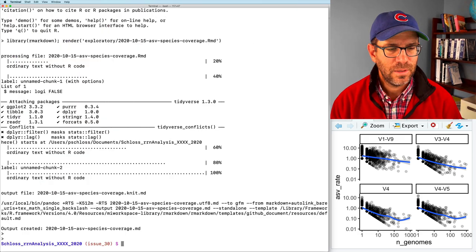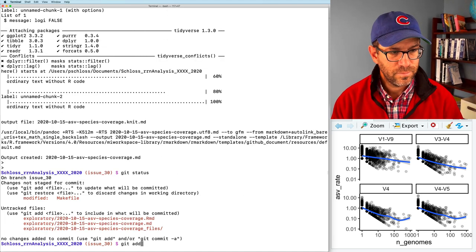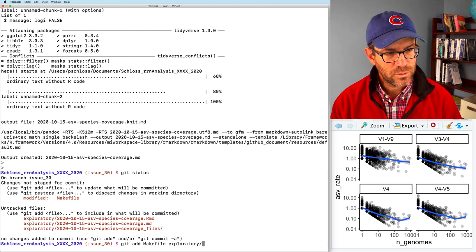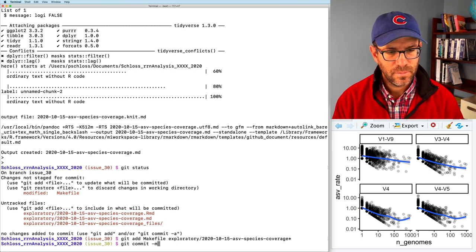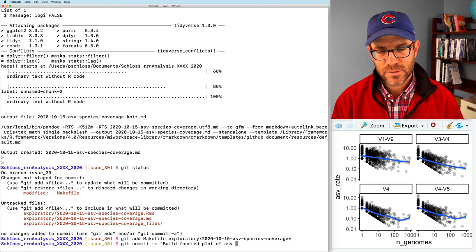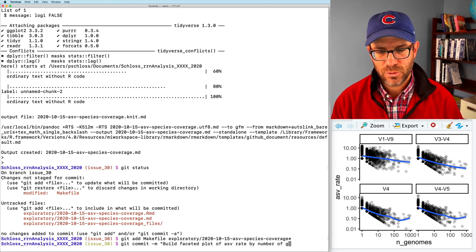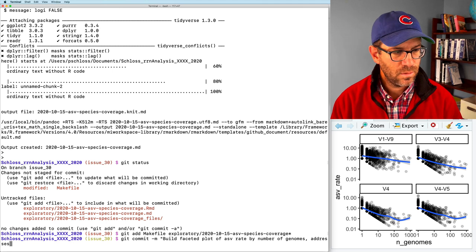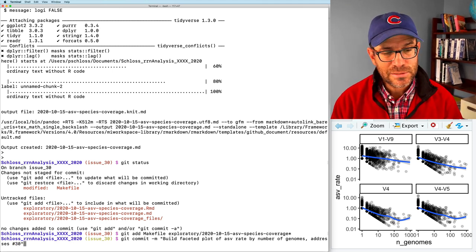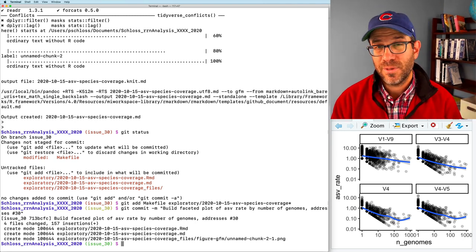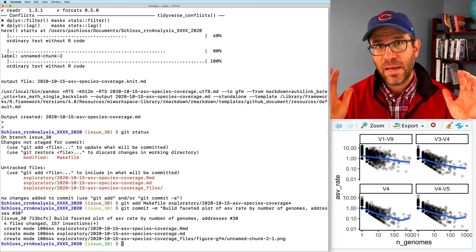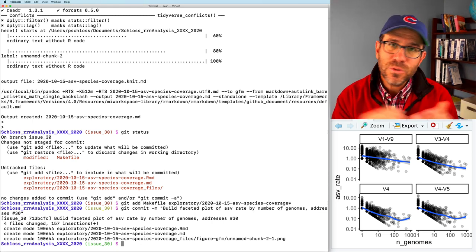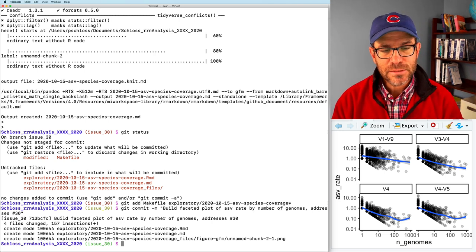So let's save that and build that up. This is going and I'm going to go ahead and commit this issue. So I'm going to add the make file exploratory stuff. And then we'll build faceted plot of ASV rate by number of genomes. And I'll say addresses number 30. But I'm not going to say closes it because we're going to come back next episode and add some more information to our markdown document and output. That gives us a sense of, for those genomes where we have a lot of genome sequences, what do the number of ASVs look like in a more tabular format?